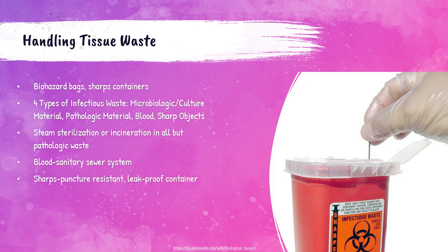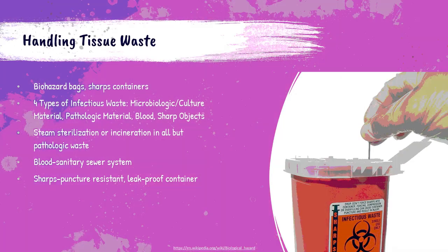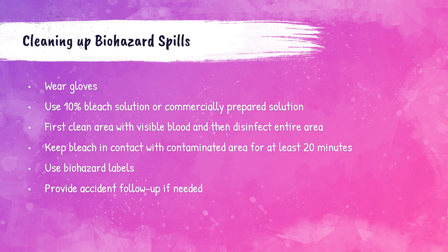Biohazard bags and sharps containers must be utilized appropriately. There are four types of potentially infectious waste in the lab: microbiologic or culture material, pathologic material, blood, and sharp objects. All of these can be steam sterilized or incinerated, except pathologic waste, which must be incinerated. Pathologic waste is any human or animal body part. Blood may be disposed of in the sanitary sewer with copious amounts of water. Any sharps — glass, needles, blades — must be disposed of in a puncture-resistant, leak-proof container labeled with a biohazard identification.